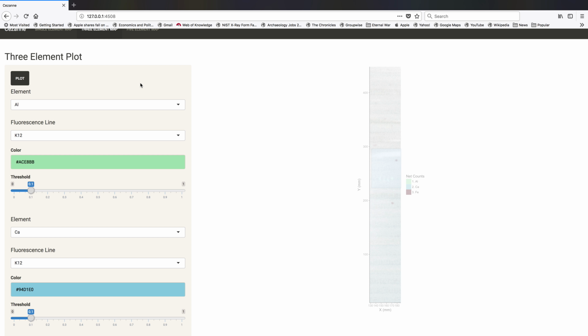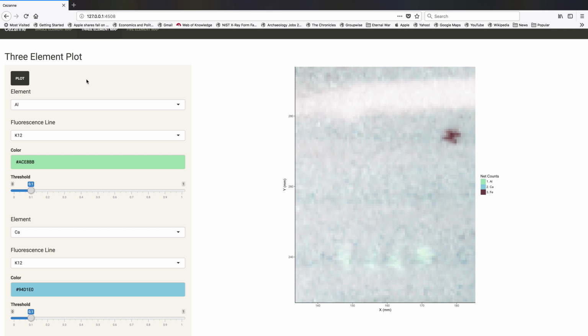So we can zoom in. Oh, sorry. One thing you have to do is double click. That sets the zoom. Then I click plot. Then it zooms in. But in any case, here you can see a lot more detailed of an image. So if you really want to explore the data in here, you can.